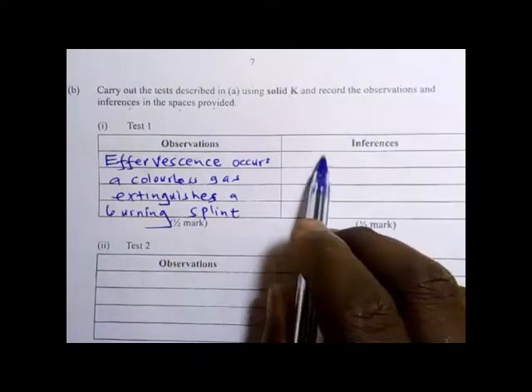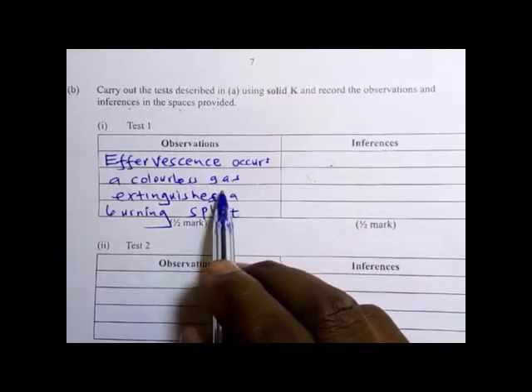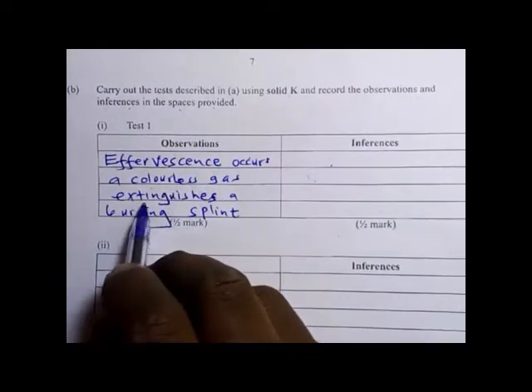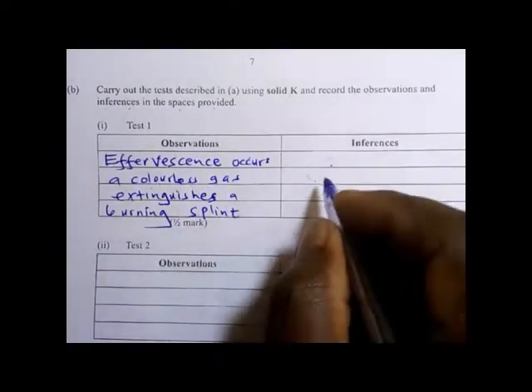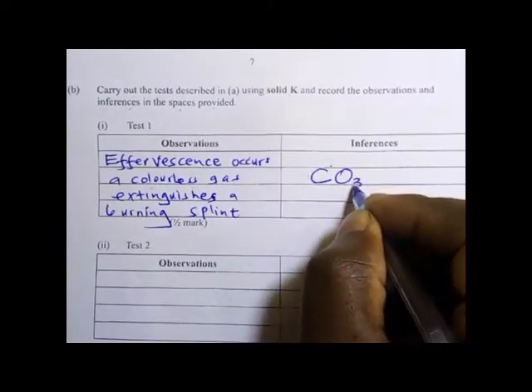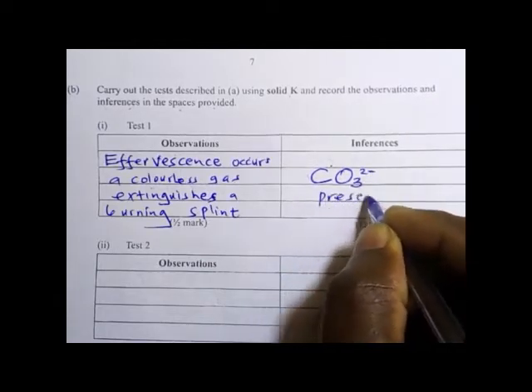So you are supposed to give the inferences of what you have observed. Definitely, if effervescence occurs and a colorless gas is produced which extinguishes a burning splint, then that tells you that it is a carbonate, and you write CO3 2- present.